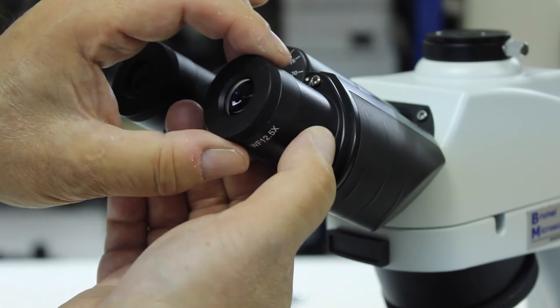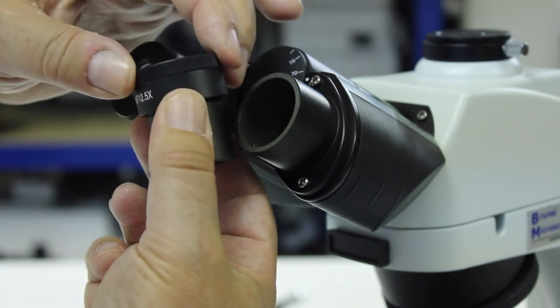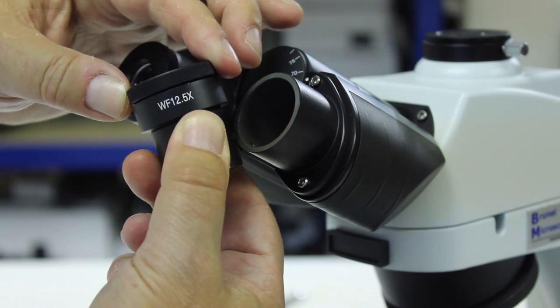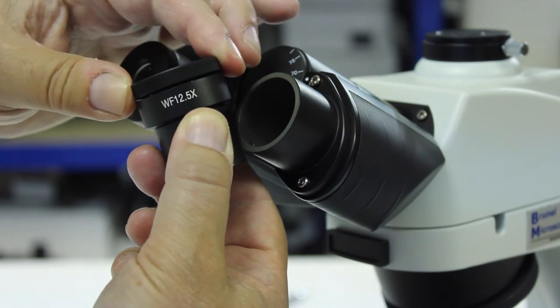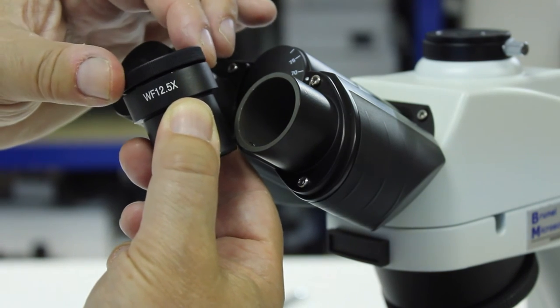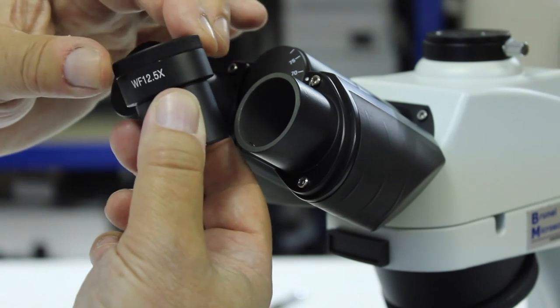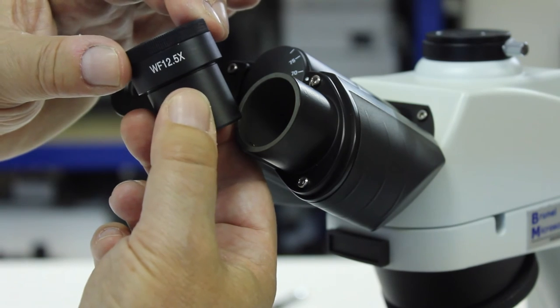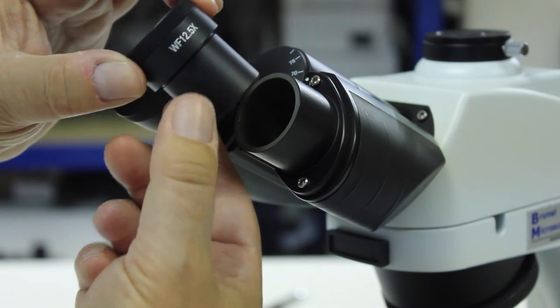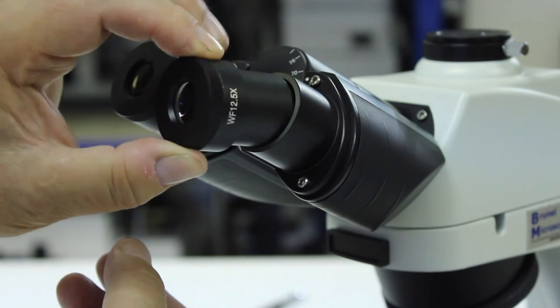These are times 12.5 eyepieces. The top lens will focus in and out, which focuses or defocuses the image that you see down the microscope. One of these eyepieces has the Wharton and Beckett Graticule in. It's a good idea to make sure that one is always in the right hand eye tube of the microscope.